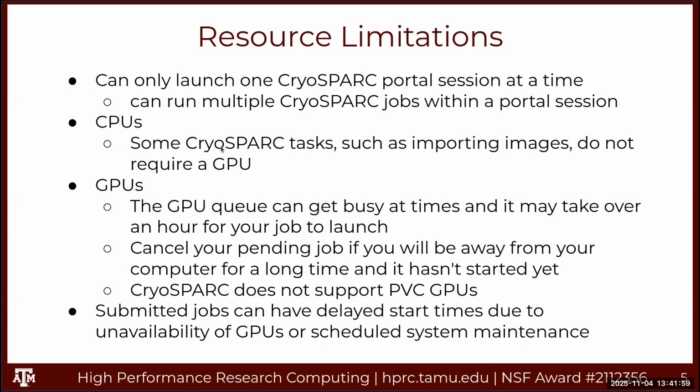Okay, if you've launched a GPU job and it's still pending, but by the time you're leaving for the day, you want to go ahead and stop that job, because if it starts in the middle of the night, then you'll be charged service units for the job as it starts, and you're not doing anything, and also it'll keep resources idle.